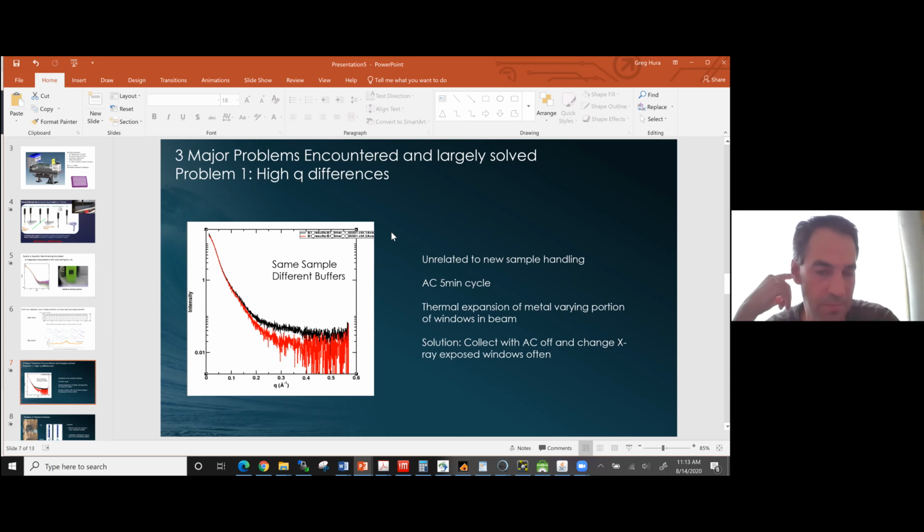So, we definitely didn't hit perfection for everything. But some data sets went perfect, and you got perfect. So typically you'll send us a buffer before your samples and a buffer after your samples, and 3 concentrations in between. That's very frequent. That's what we've asked for.